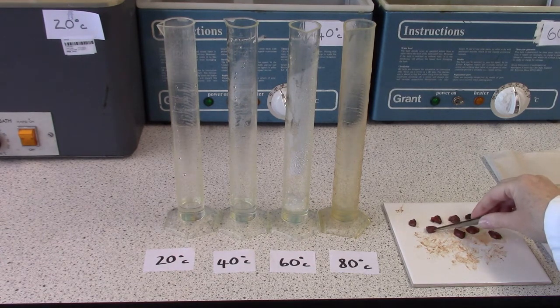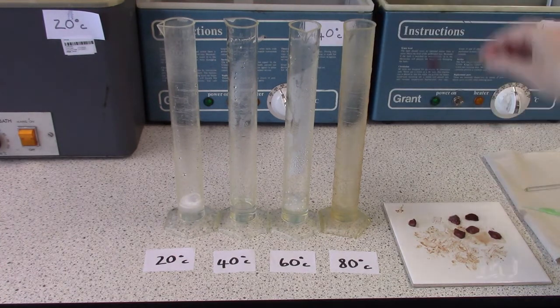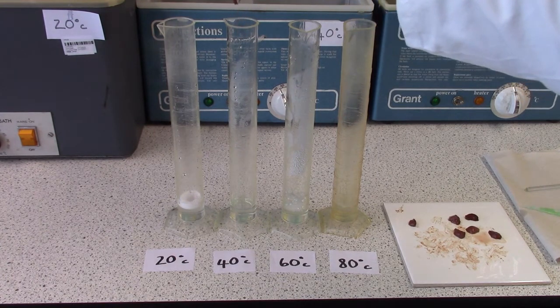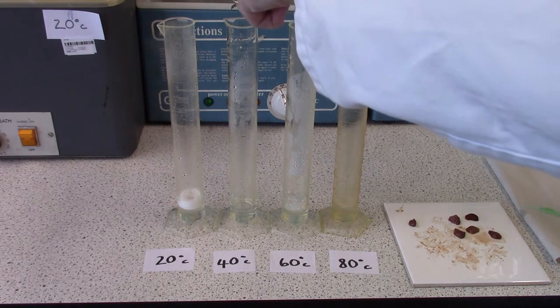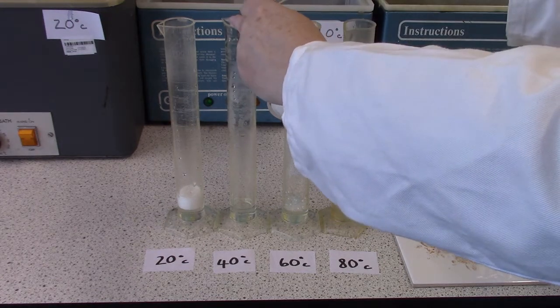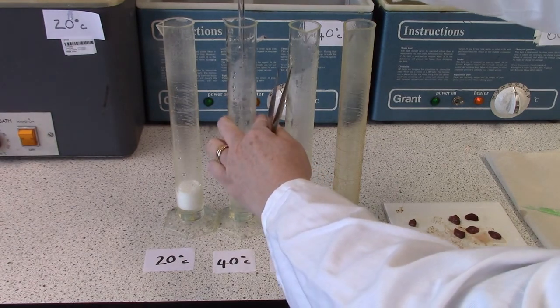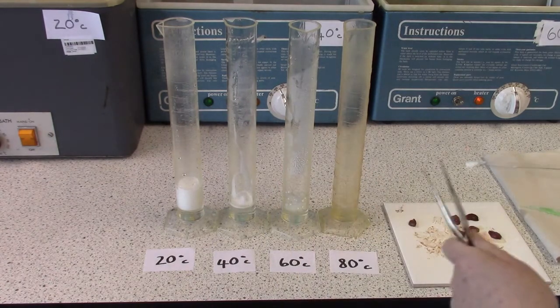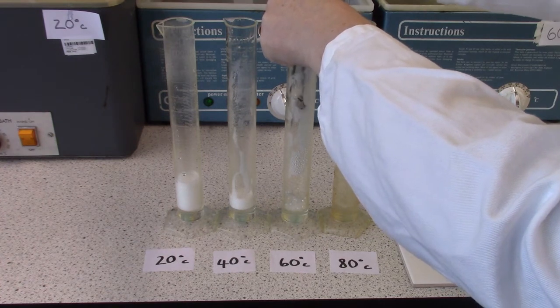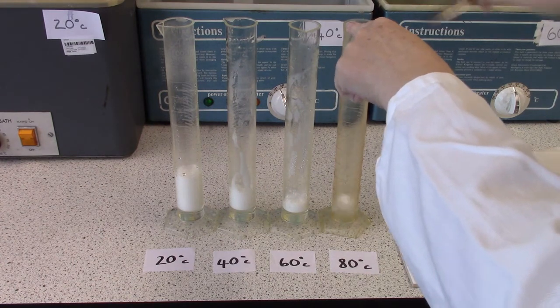So I am now going to put my liver into each and hopefully it will go right down into the middle. So 20 degrees, 40 degrees, 60 degrees and 80 degrees.